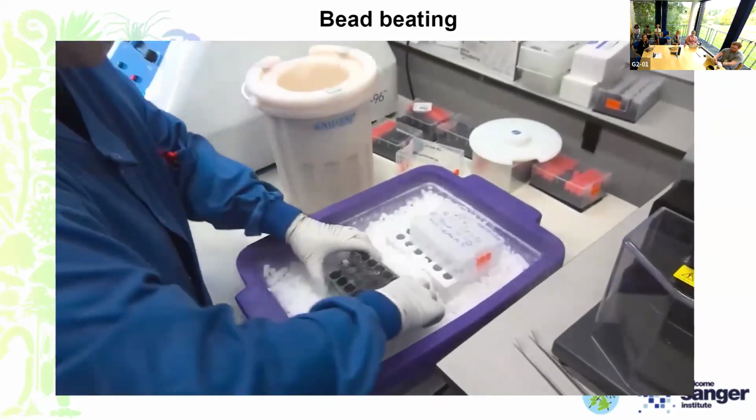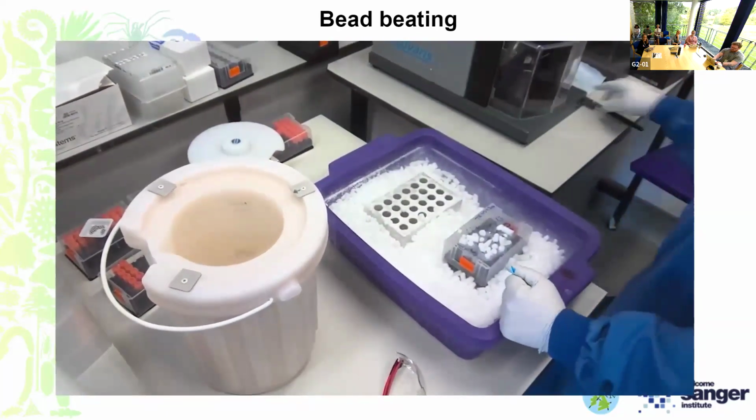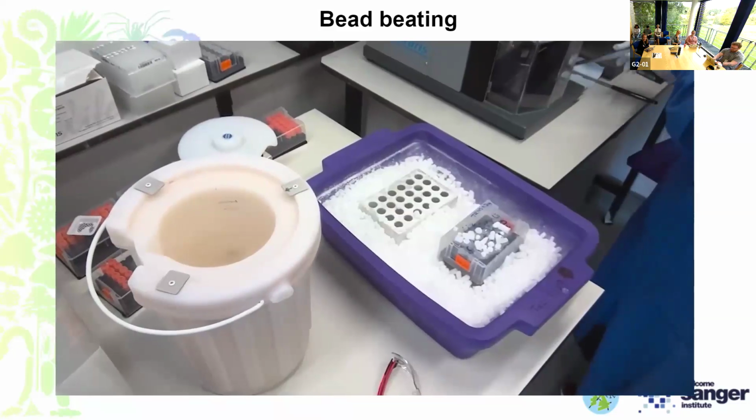The samples are now placed back on dry ice. The lid is put back on the box so that they can then be resubmerged within the liquid nitrogen.